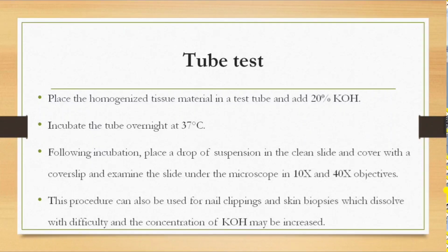Following the incubation, you can mix the suspension properly, place a drop of suspension on a clean glass slide and cover it with a cover slip. Examine the slide under the microscope in 10x and 40x objectives. This procedure can also be used for nail clippings and skin biopsies, which dissolve with difficulty, and the concentration of KOH may be increased.